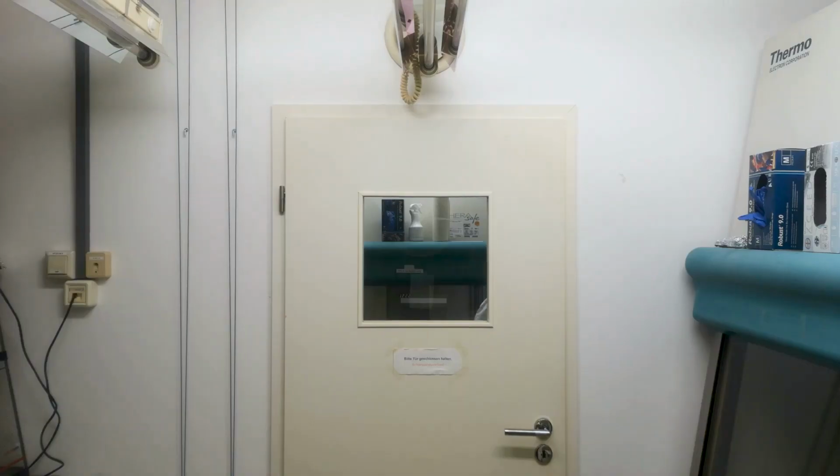The ancient DNA facility is structured into 2 rooms. The outer one is of cleanliness level gray, and the inner one is kept even cleaner, so we call it level white. The rooms are irradiated with technical UVC light for 4 hours at night.